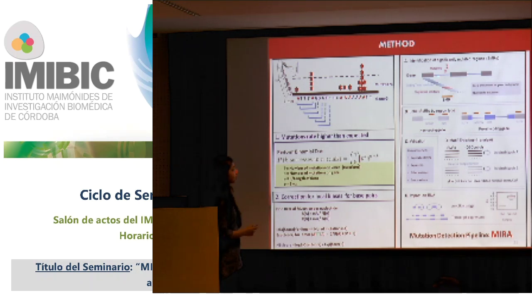It takes the ones that pass this test score, which give us our SMRs, the significantly mutated regions, and labels where they are falling. Then I go back and trace whether they belong in intron, exon, or 5'UTR. And once we have these significantly mutated regions, I want to know if there are binding sites present on these SMRs, if there are certain RNA binding proteins that are getting mutated specifically.